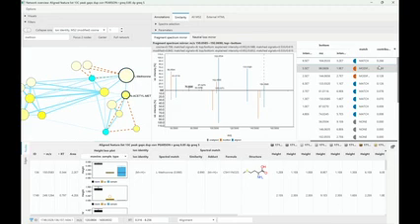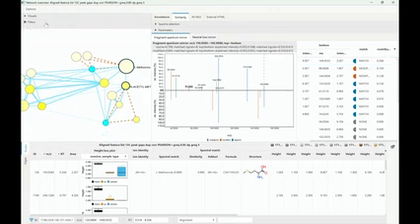Still, we know if you have a standard, that's the best way. You inject it, you're going to know. It's very hard to get by. And otherwise, you have to manually review. And if there's a lot of signals, it's much easier to say this is very likely the compound or a very similar compound. And if there's only water loss, some not so significant losses, then you have to reconsider, let's say. Or maybe use some other fragmentation technique.